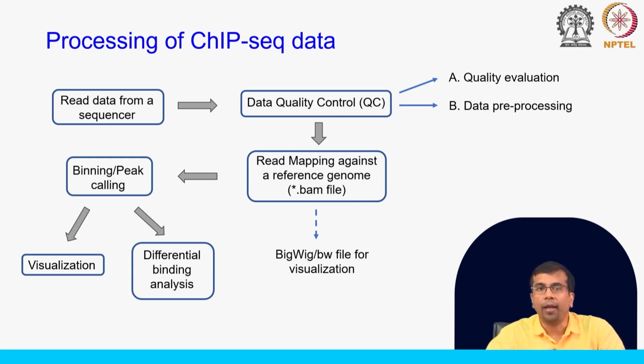We will do a ChIP-seq experiment on both sample types, and then we will identify the peaks, and once we have identified the peaks, we can ask whether the peaks are similar or whether there is any change in the location of the peaks in the genome. And this is what I mean by differential binding analysis.